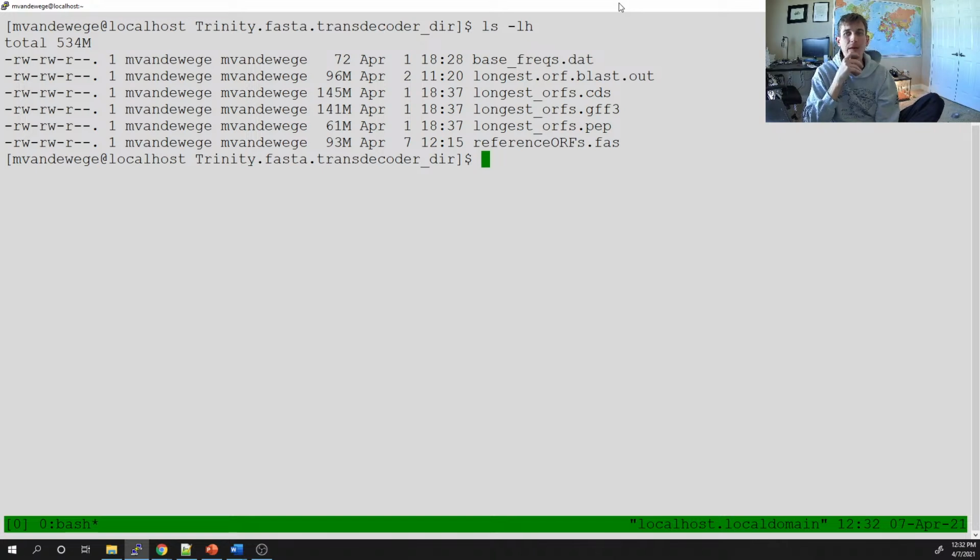All right, so that's all I'm going to do for today. On Friday, I will do the mapping, so we'll go through the mapping step of finding out where our clean reads go to each transcript and how many transcripts have reads mapping to them.